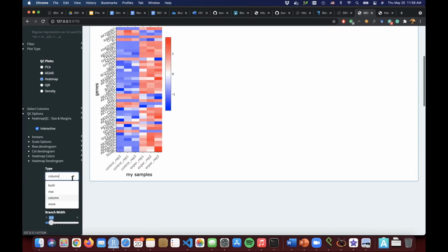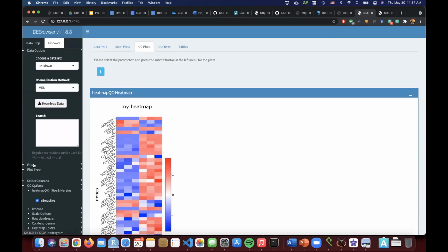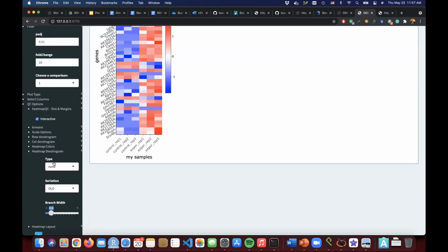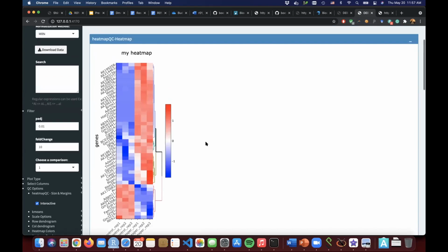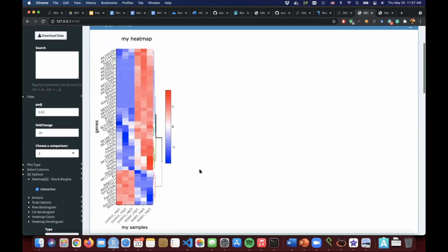And I have a question about fold change. So for some genes, for example, the value is 0 for controls. For whatever reason, let's say the gene was not expressed in the controls, and then in the experimental samples, it was say 9. There was a gene like that. How do you calculate fold change? When you calculate fold change, you divide the mean of the experimental samples by the mean of the controls, right? So if the mean is 0 for the control, how can you divide 9 by 0?